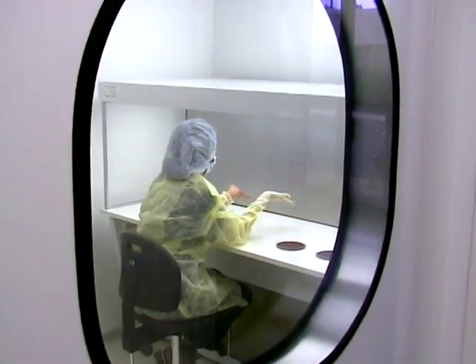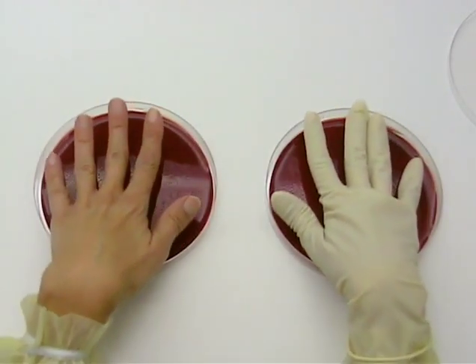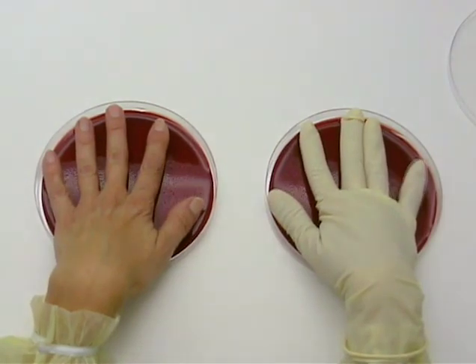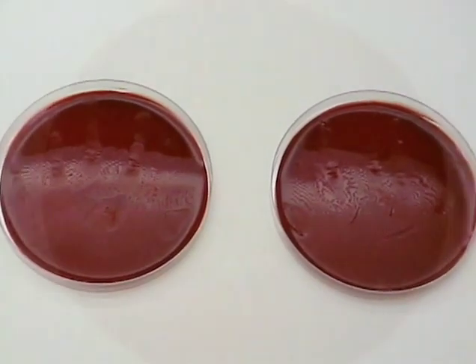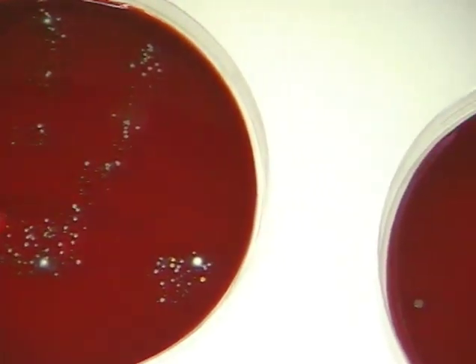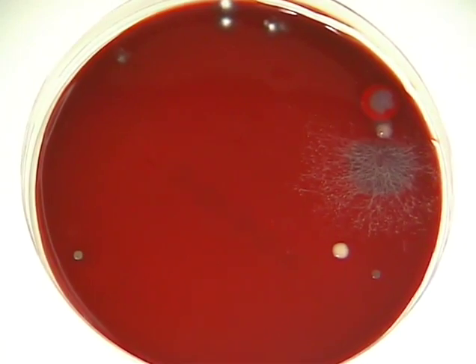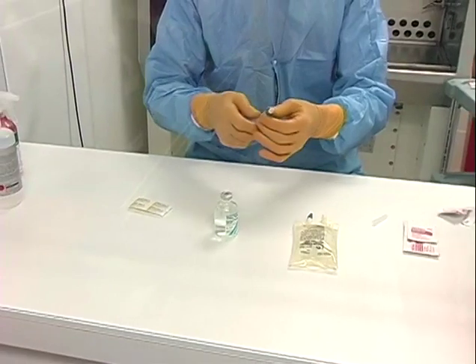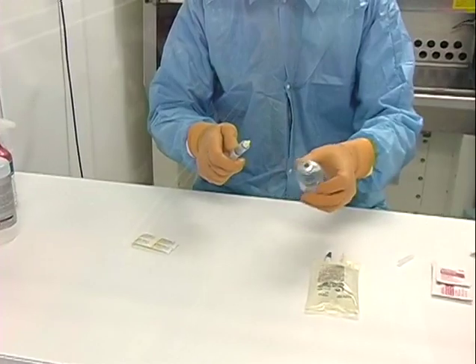The gloved and prepared hand on the right and the washed bare hand on the left are placed onto two Petri dishes containing a microbiologic growth medium. Following incubation, it becomes clear that the contamination burden on the bare hand has increased to many times greater than that of the gloved hand. Gloves act as a barrier to this type of contamination fallout from the hands, and should therefore be donned and prepared properly prior to entering the compounding environment.